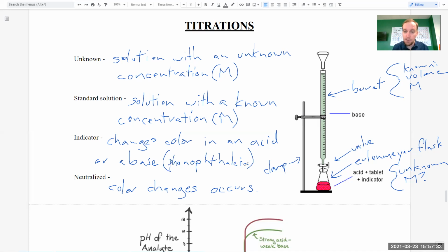So like I said before, we're going to very meticulously either swirl the flask or use a stir plate. A stir plate basically has a magnet in it, and then the magnet stirs electronically. Then we would put in a stir bar, which is a plastic coated magnet, and it would go in the bottom of the flask, and it would spin as the stir plate has a magnet that spins. It would spin for us, right? It's kind of cool. Or we would just stir it with our fingertips very gently, okay?